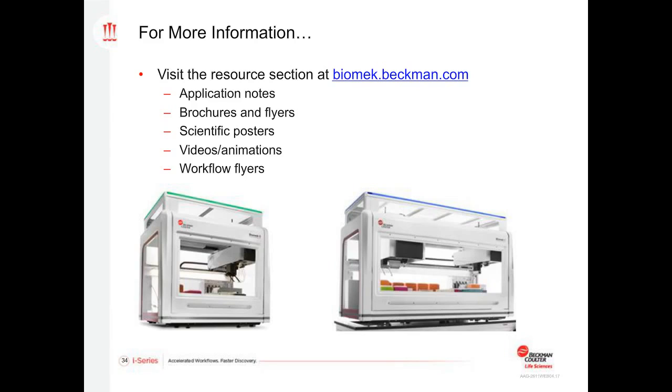One of the nice things on the iSeries is that there's more universality of the integration, so those become more easily swapped in and out. When it comes to just changing the positions on the deck, for example, if you needed more heating and cooling positions or more shaking positions, or had some direct integrations that changed your deck configuration, that's very easily done. That's basically just popping out the current ALP positions, putting on the next positions, and then doing a quick AutoFrame using our tools that are available.